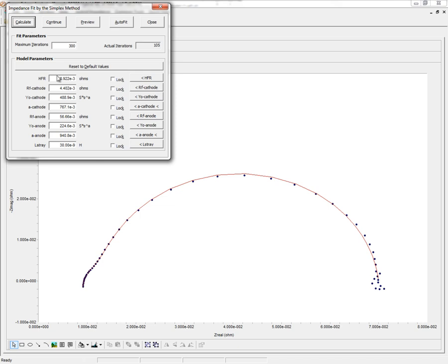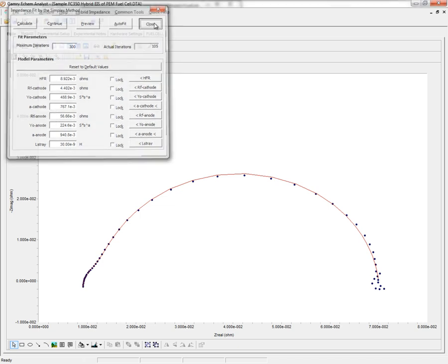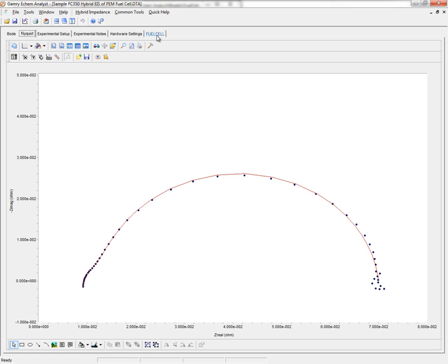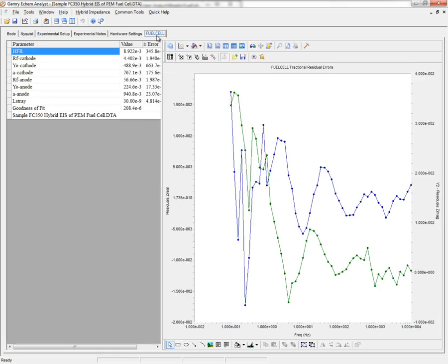I click Calculate a few times until I see that these values are no longer changing significantly. I will click Close, and I can see that a new tab has been added with values for each of those parameters along with some error and residuals.